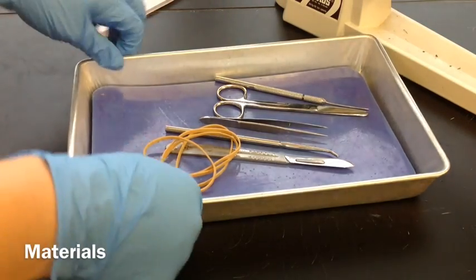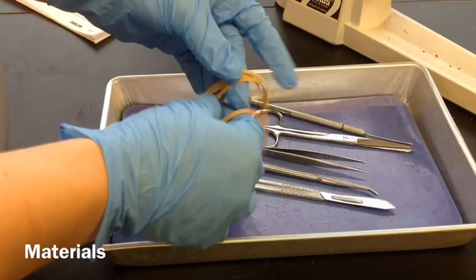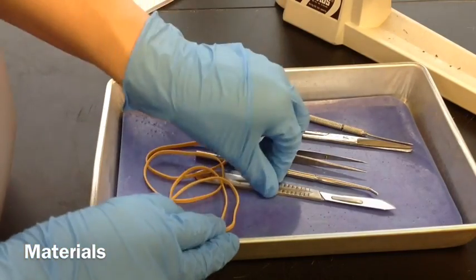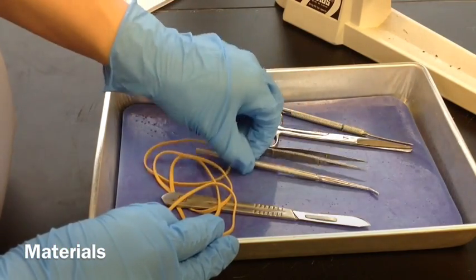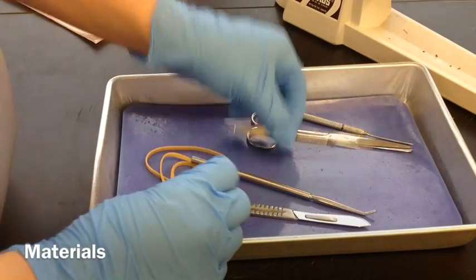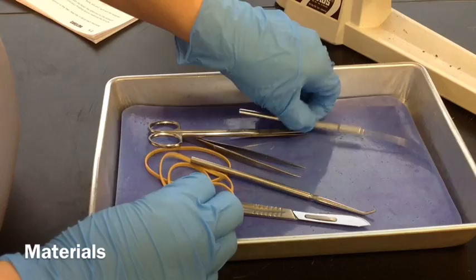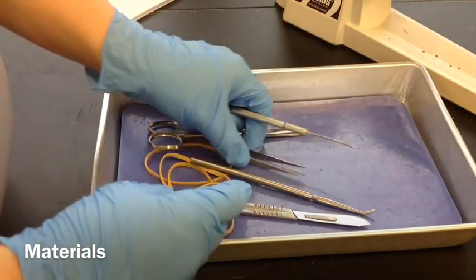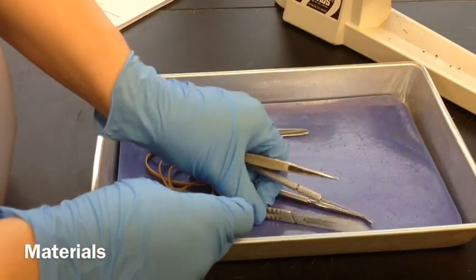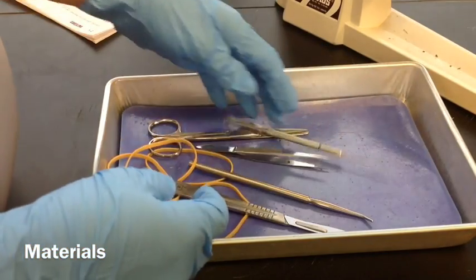Start with the materials you'll need: your dissecting pan and four rubber bands. We have our scalpel, the blunt probe because it has a non-pointed end, your forceps, your scissors, and a needle probe. The needle probe is sharp, and so are the forceps and the scalpel. Be careful with those.